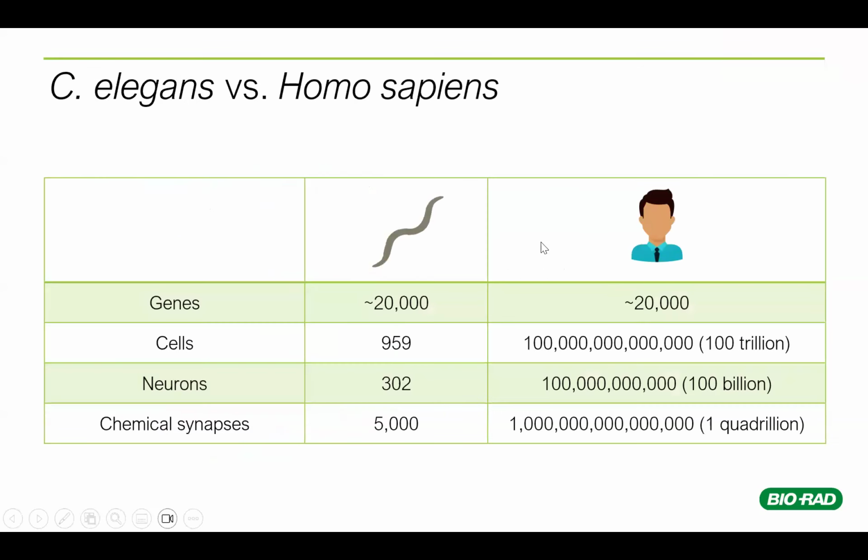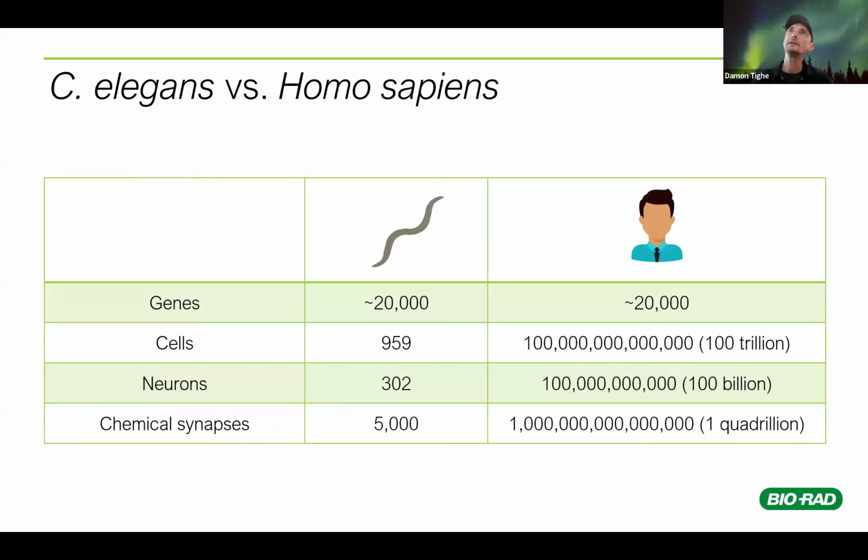So Damon, just speaking about nutrient requirements, Adrian asked, can NGM be substituted for another type of agar? That's a good question. I personally haven't played around with that much, so I don't have a good answer for you.